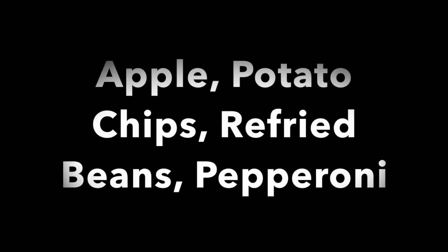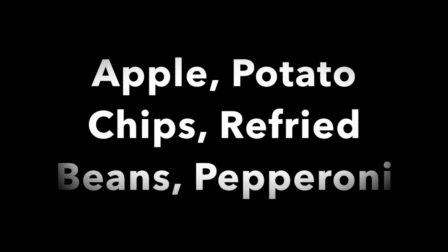After you know what the positive and negative responses are for each, you will next be determining the unknown combinations of macromolecules found in 4 different foods.